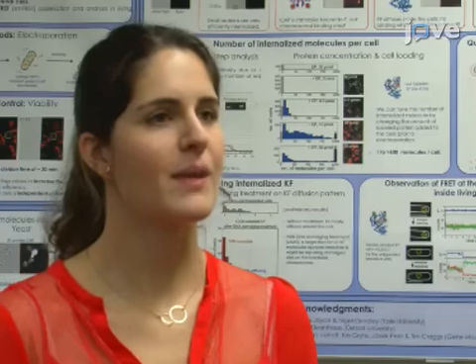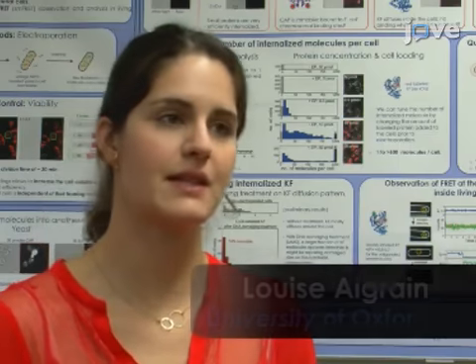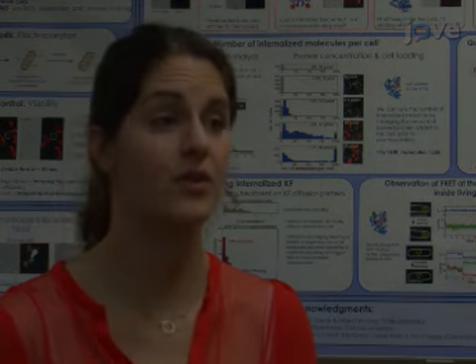We reasoned that by loading living cells with biomolecules labeled with organic fluorophores, we would transplant in living microorganisms the main advantages of these fluorophores, that is, brightness, photostability, and small size. We then hope to follow the localization and diffusion of DNA or proteins in their native environments on much longer timescales, which would match many important biological processes. The main advantage of this technique over existing methods, such as microinjection, is that it can also be applied to microorganisms that are small.